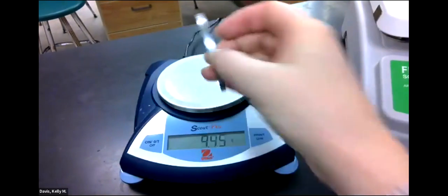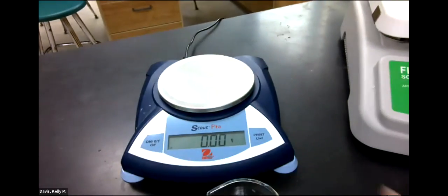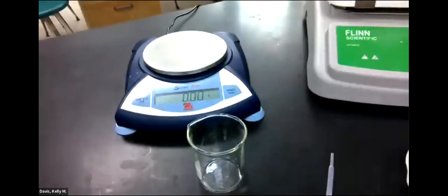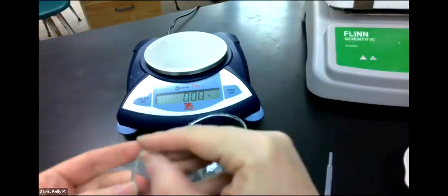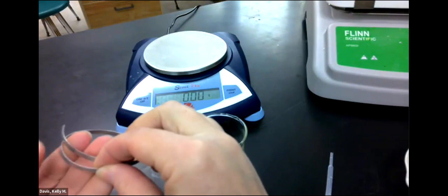All right, so then I'm going to take my magnesium and put it in the beaker. Let me move this so you can see it. I'm going to put the magnesium in the beaker. I want it to lay flat, so I'm going to coil up my magnesium so that it lays flat in the beaker.